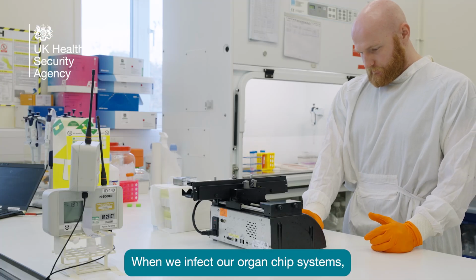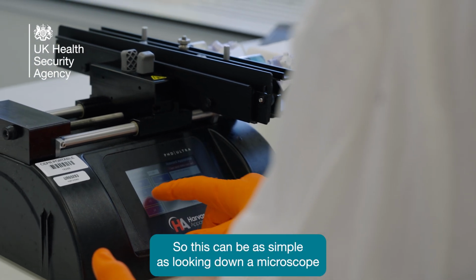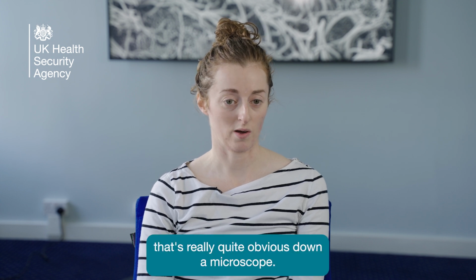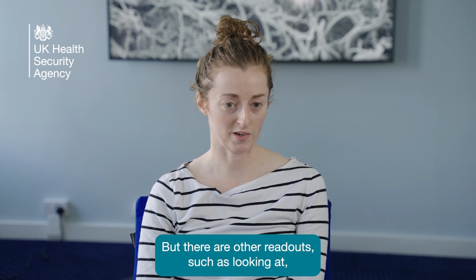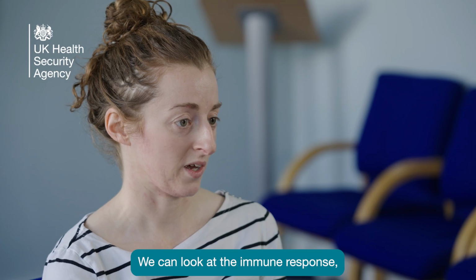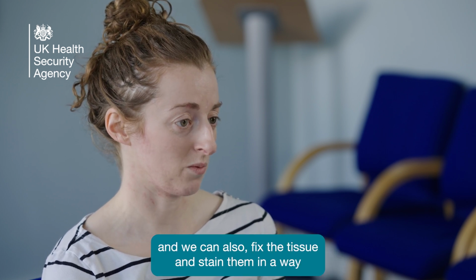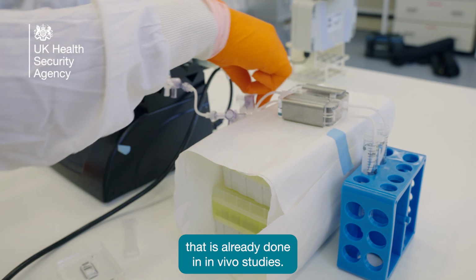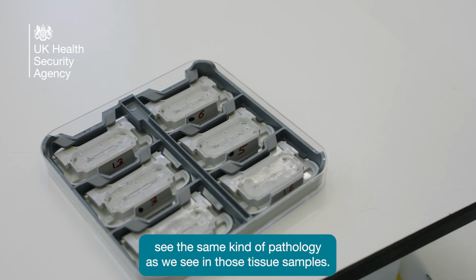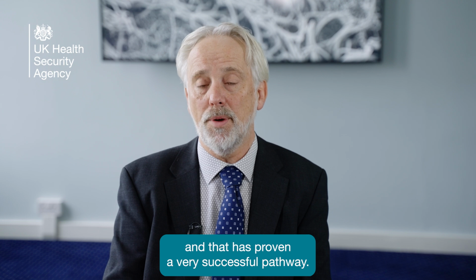When we infect our organ chip systems, we can look for various different readouts of virus infection. So this can be as simple as looking down a microscope and looking at the effect that virus has on the cells. If it's killing the cells, that's really quite obvious down a microscope. But there are other readouts, such as looking at the amount of virus that is being produced by the cells. We can look at the immune response, and we can also fix the tissue and stain them in a way that is already done in vivo studies, and we can see the same kind of pathology as we see in those tissue samples.